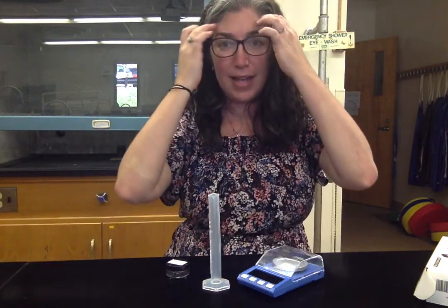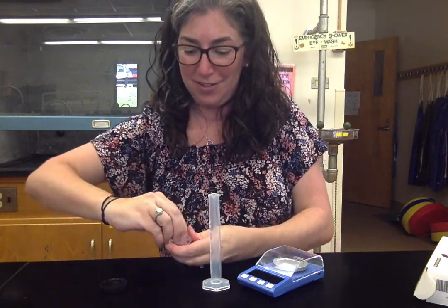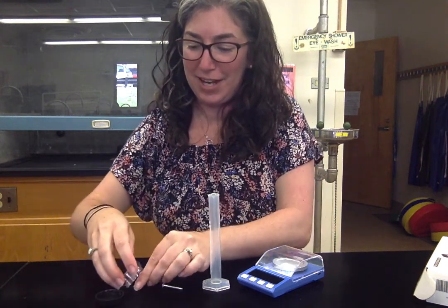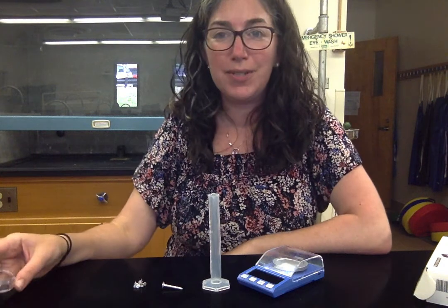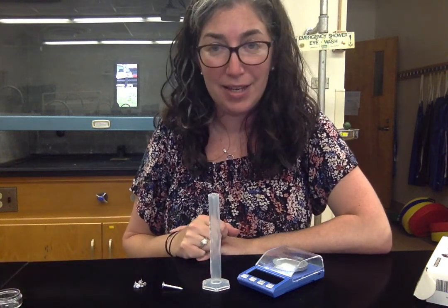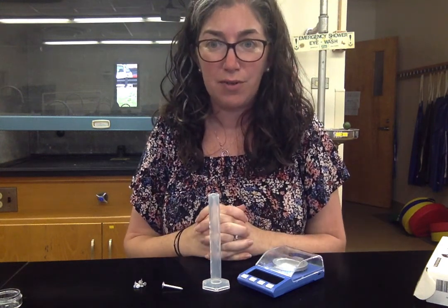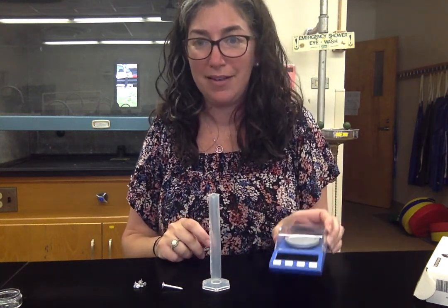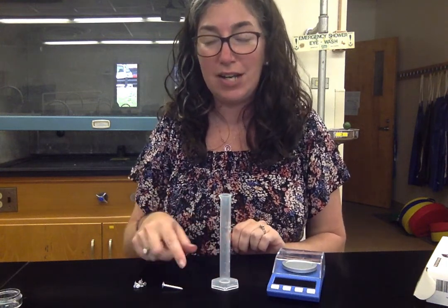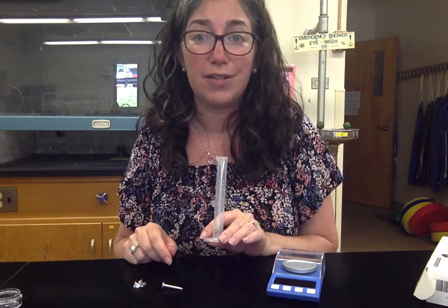In this lab we have one large nail and six smaller nails. They're made out of two different types of metal and we're going to try to identify those metals by measuring their density. Density is mass over volume, so you'll need to take the mass of the nails and measure the volume. Because they're an irregular shape, we're going to measure volume using something called water displacement.